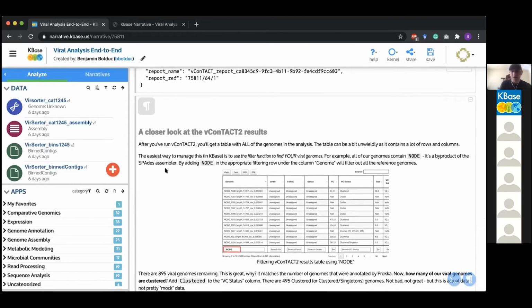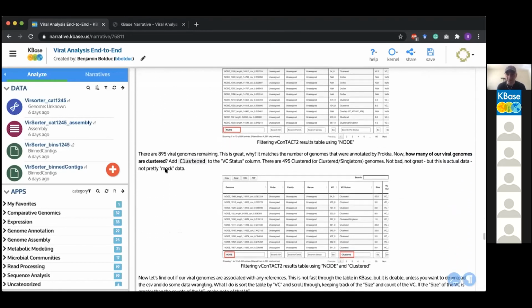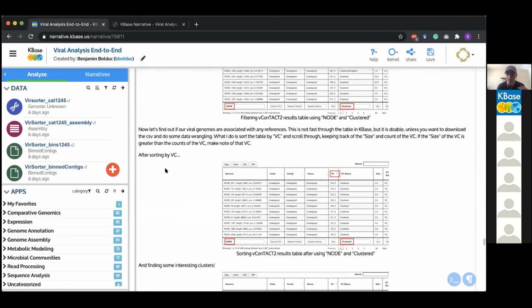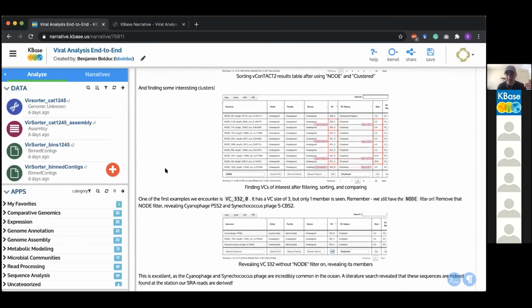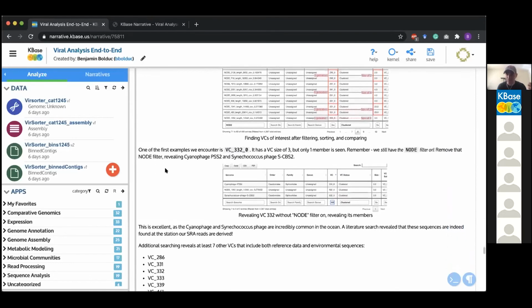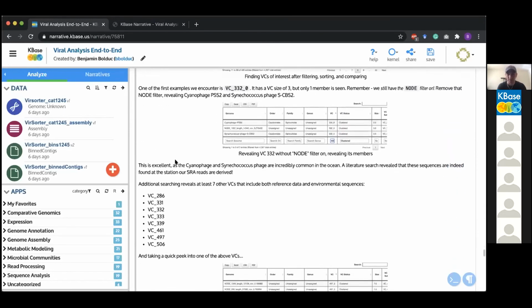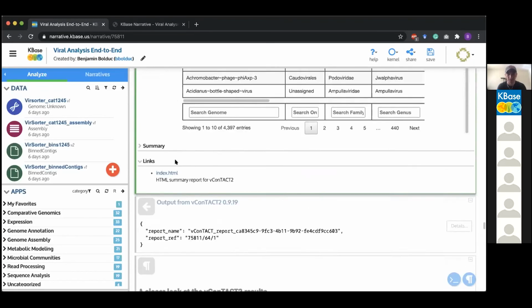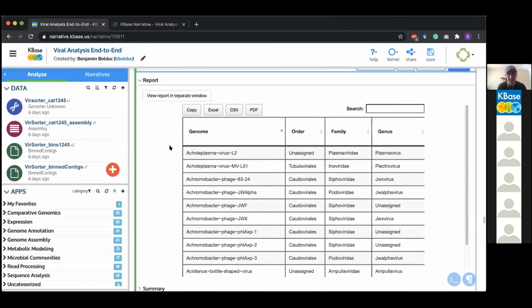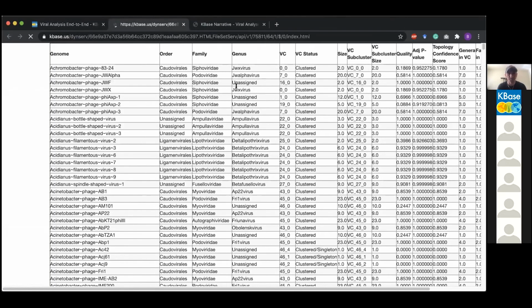I go into detail about how to process and look over these results in this table, and I will do that. In case the next minute or two I'm going over this is too quick, you can follow along here, so you don't really miss anything, I should say. So what I'm going to do is view this in a separate window.